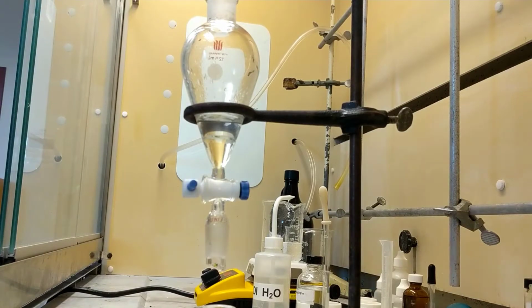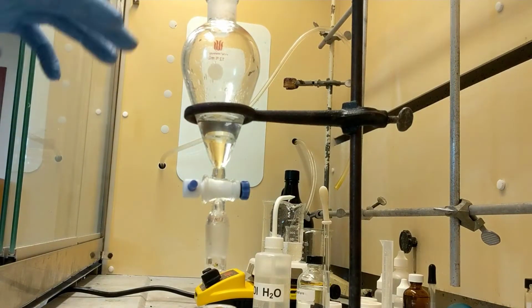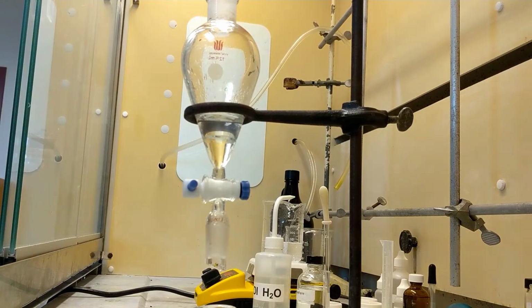Alright guys, we're back. I shook it vigorously for a little while. As you can see, I have it sitting in my iron ring, and now I'm about to do the extraction, okay? Well, the extraction already happened. Remember, the goal was to pull the caffeine from my aqueous solution into my organic solvent, since it's more soluble in the organic solvent.